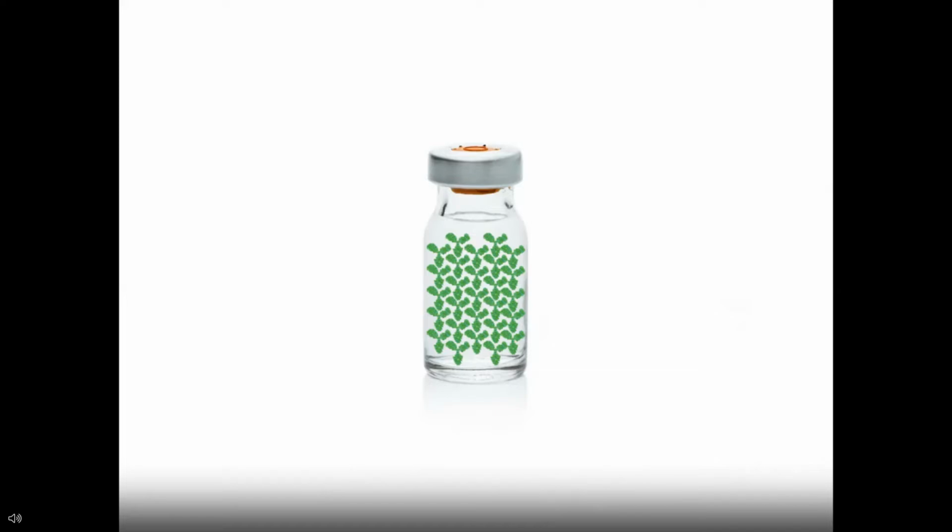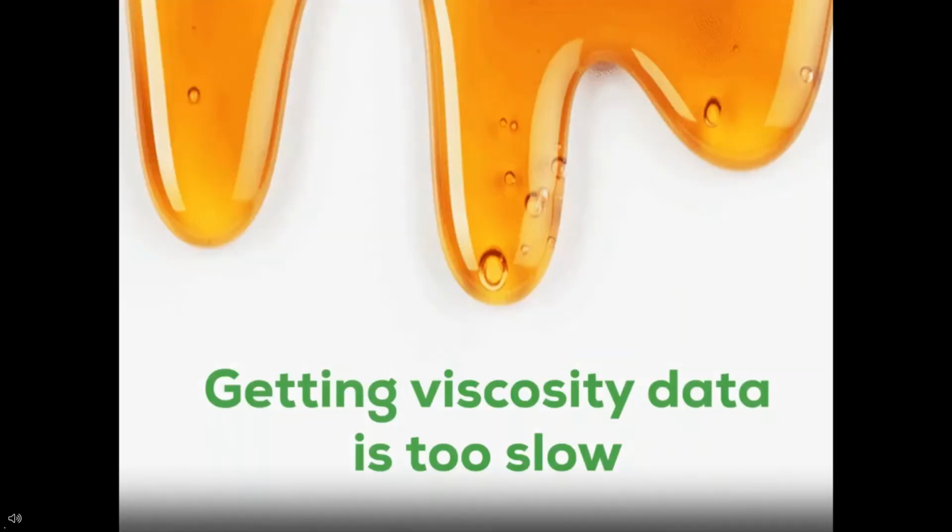In the worlds of antibody engineering and formulation, viscosity raises the alarm when your antibody is prone to sticky self-interactions or if your formulation isn't going to cut it. In process development, high viscosity can lead to issues with filtration or fill-finish processes.